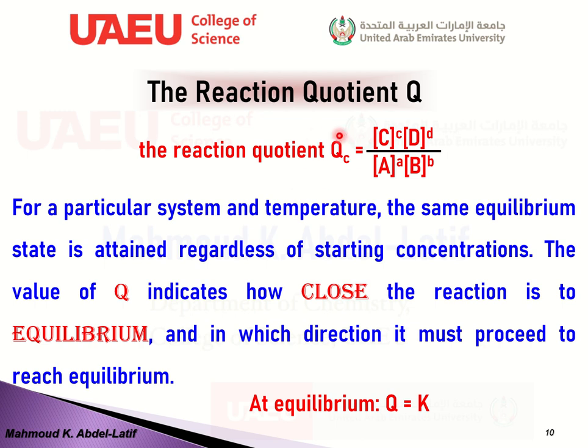So the value of K of a certain reaction will be constant.